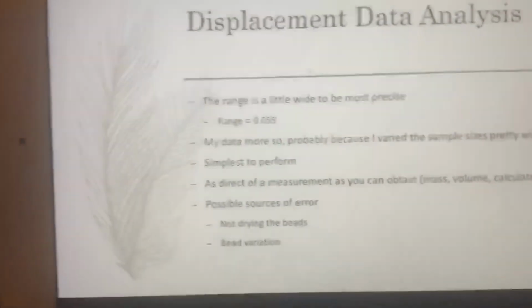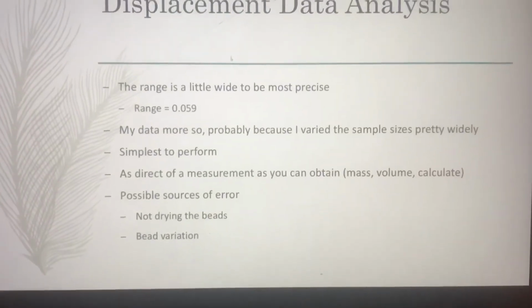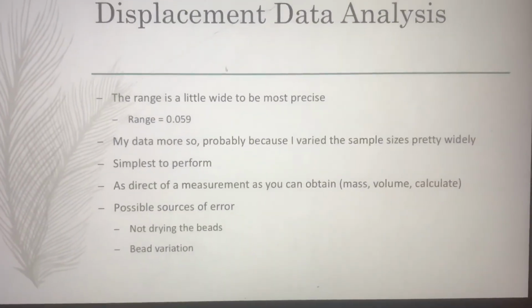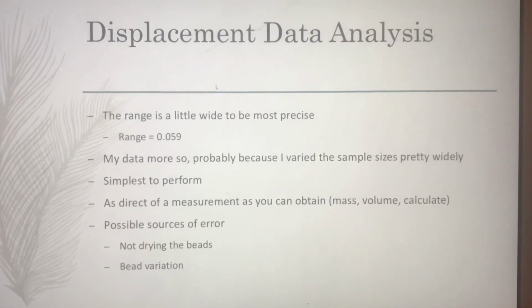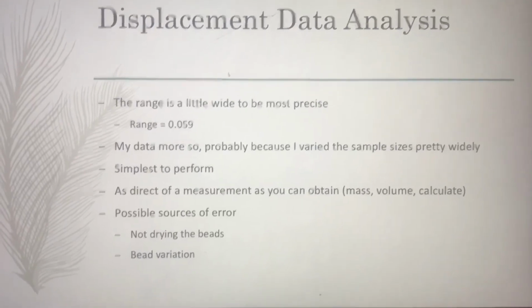So back to analysis for the displacement. Again, this was the simplest to perform. It seemed the most direct measurement to me, because you were measuring the volume as directly as you could. The mass was easy to do, and then you calculated from there.